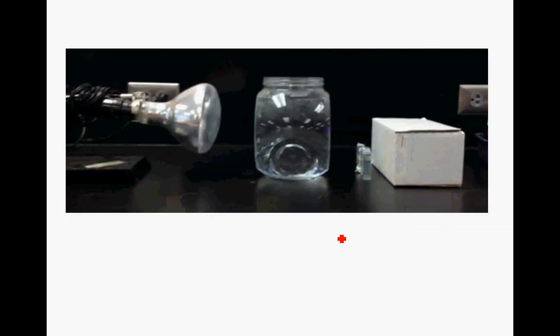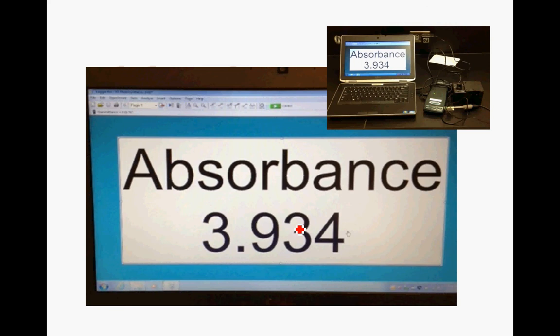Between measurements, you're placing the cuvettes right here between the box and the heat sink, where light is shining through them. This is the light source driving photosynthesis. The question for you is what is the unit on the rate of photosynthesis - what goes on each axis? You'll be able to see the absorbance easily as the default setting, and right up here it will also show the percent transmittance. Both of these values get recorded in your table.